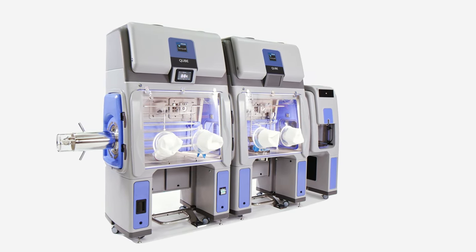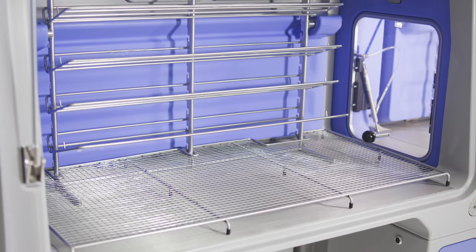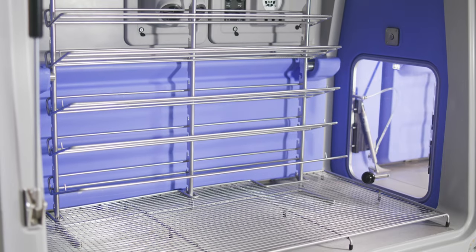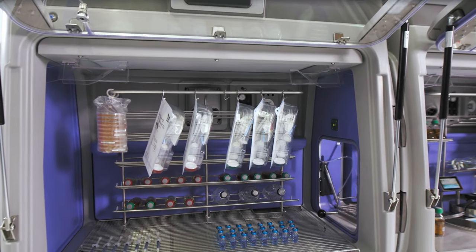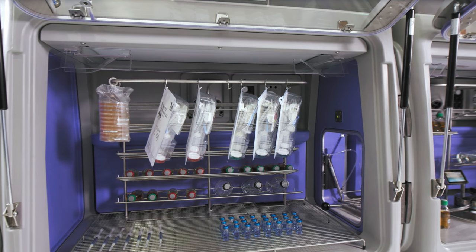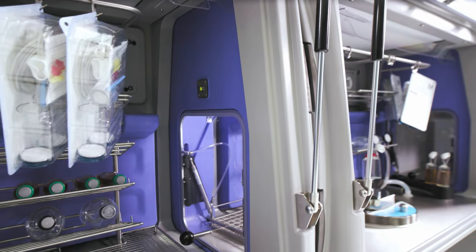Unlike traditional stainless steel isolators, the BioQuell Cube system is modular and made from molded polypropylene, offering distinct, tangible benefits. Because of its manufactured method, production of the system is quicker, consistently crafted, ergonomically designed, and avoids the risks of leaks associated with welds, joints, and gaskets found in other isolators.